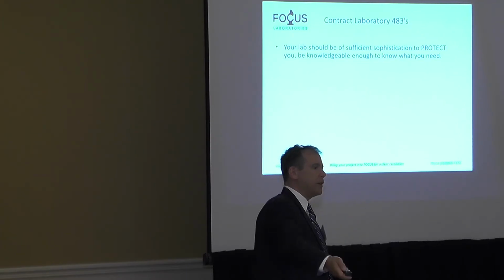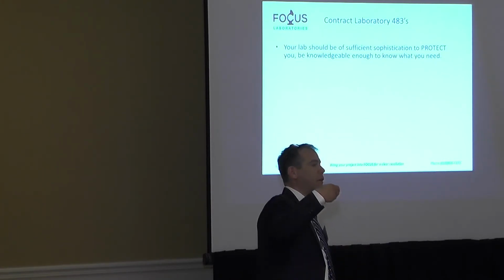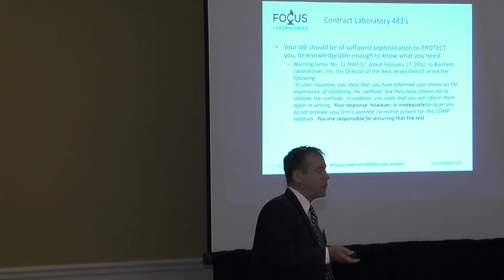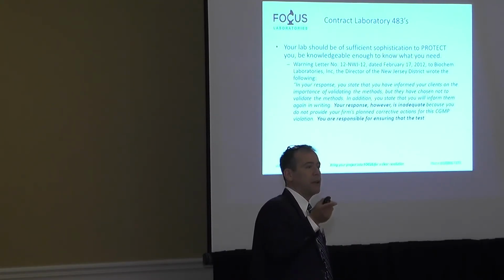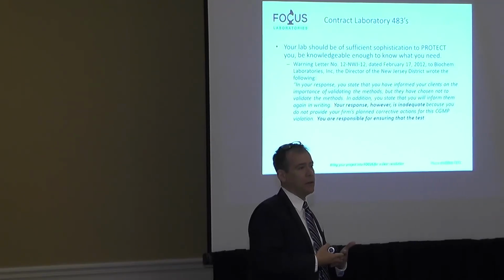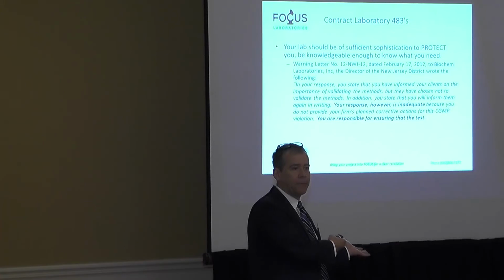When you're letting go of this, and there's a reason to let go because they're better at it and it can be done more effectively, and they're impartial, those are all great reasons to outsource. But you have to be sure they have the sufficient sophistication to protect you. There may be things that you don't know that they should know, right? And so this goes back to, I think Catherine and Kelly both said, who's responsible when something goes wrong? I've been in many lab audits and have had many problems when the agency will come in and previous management maybe didn't validate something.